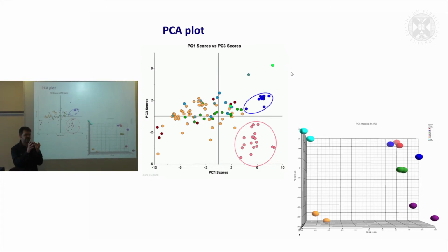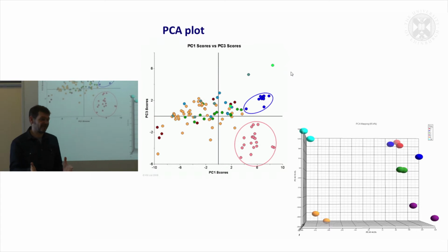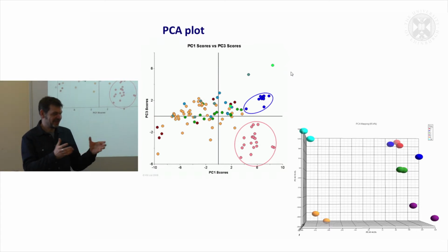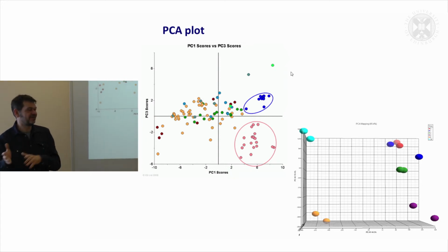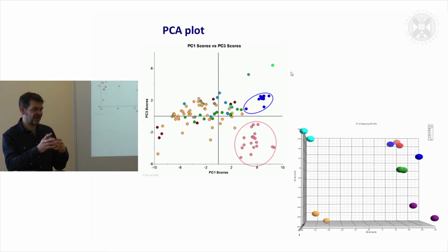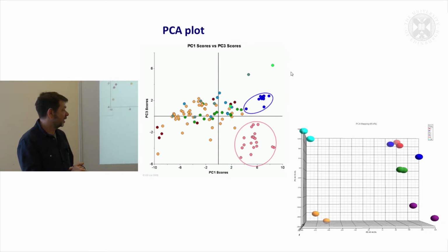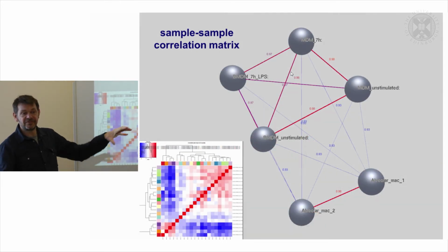Again, what you're really trying to do is display data in a context where it says, are similar samples grouping? So if you've analysed 2 brain samples, they should look like brain samples. They shouldn't be clustering with liver. If you've done time points, the later time points should definitely look different from the early time points. This is the basic biology that your samples should group by, and you need to be aware of that. Now, what I'll show you is how to use BioLayout for doing this.